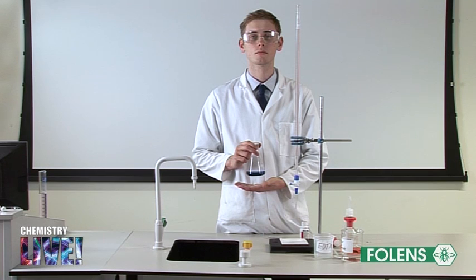Using the data obtained when you carried out this titration, calculate the total hardness of the water. The method of calculating the total hardness of the water sample is shown in your textbook.